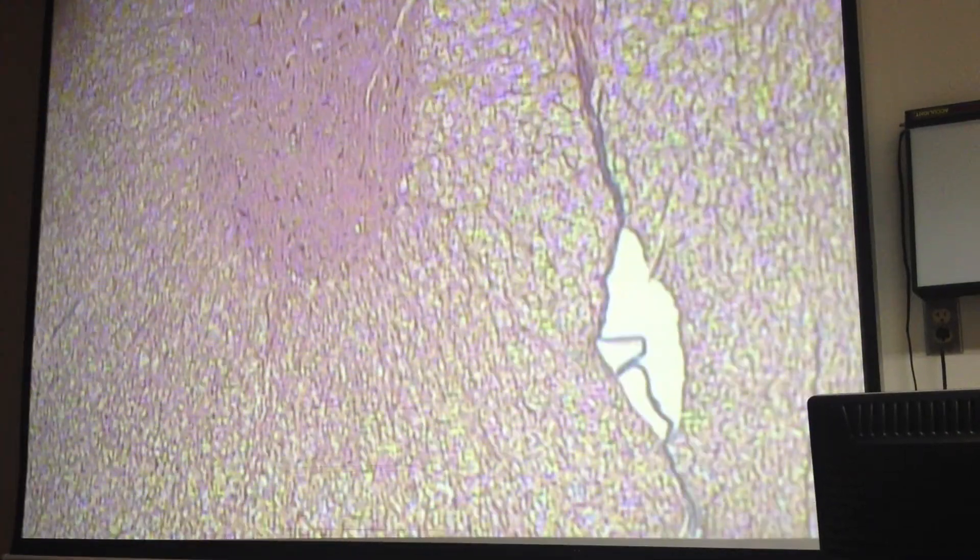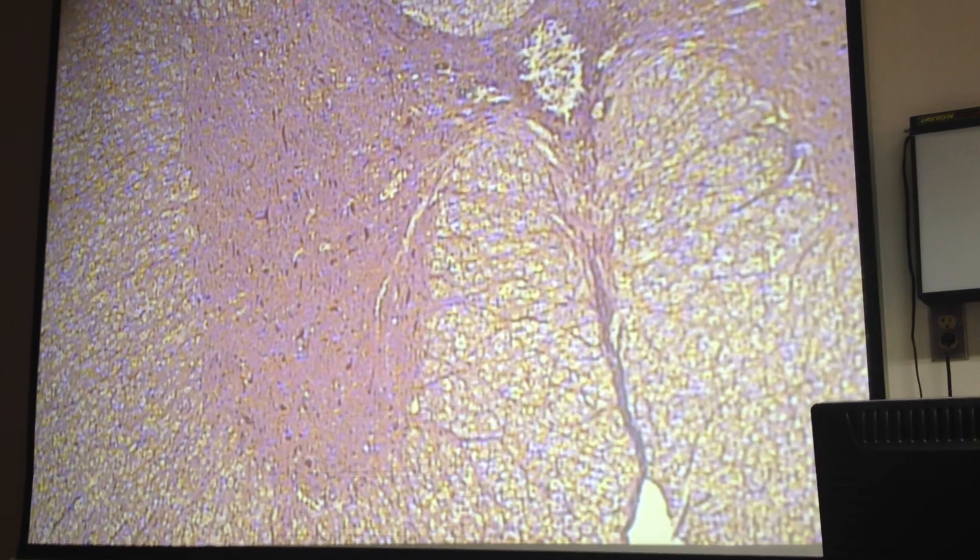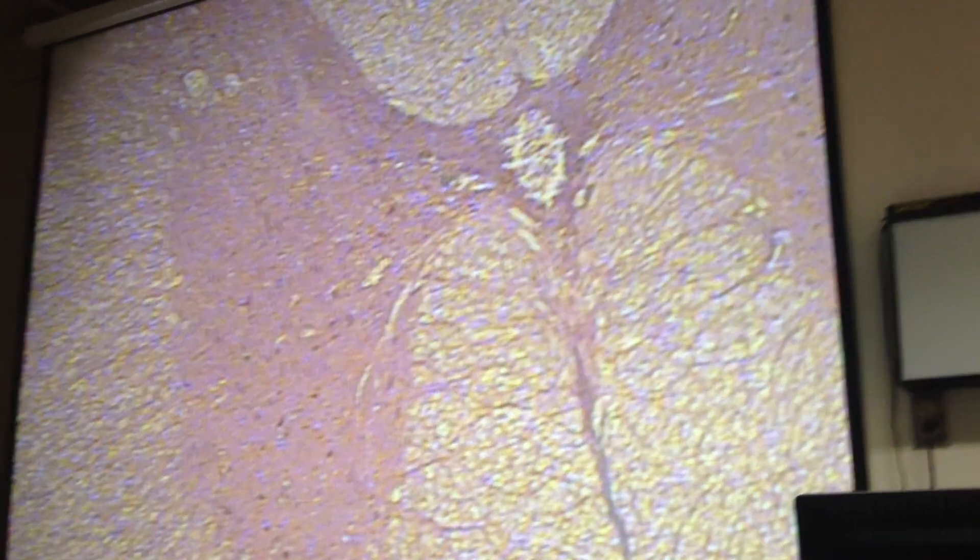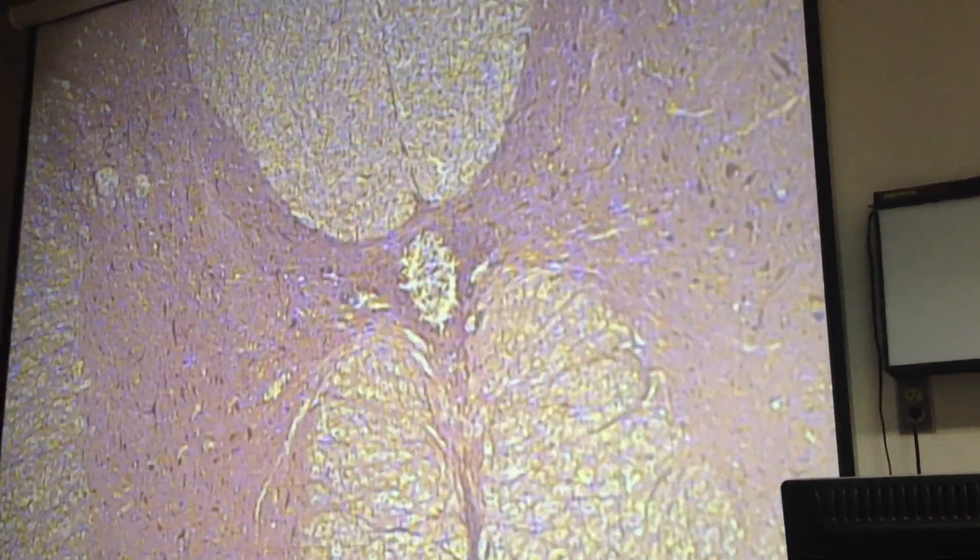Okay, this is a nervous system organ. And so if you scan, I see a space right here. What's that opening, that circular? That's the central canal. Yeah, and so if we look there and we see this, and then we compare and go to the other side.